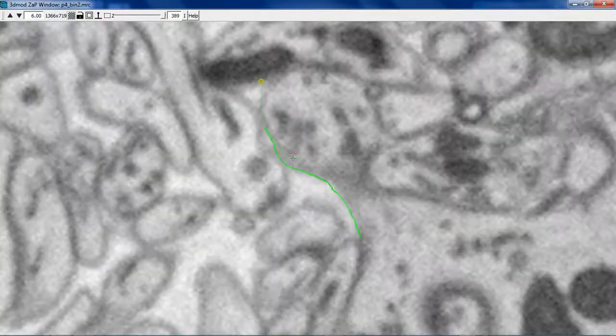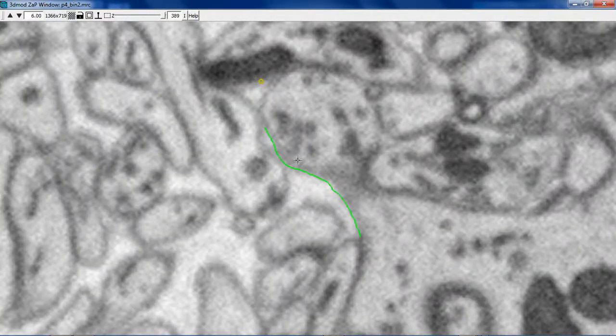And we want them both to merge here into surface 3. So we already have a surface 3 contour here. What we need to do is we need to overlay a surface 4 contour here and a surface 5 contour here so that our mesh is continuous.